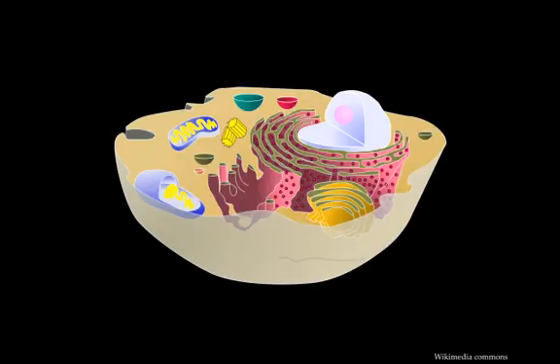Cellular structures such as organelles are usually large enough to be visible in optical microscopy, but not any of their fine details. Mitochondria are a good example. They're big enough to see clearly in a light microscope, but really just as dots. We can get an idea of their number and distribution, but only very rough morphological features.